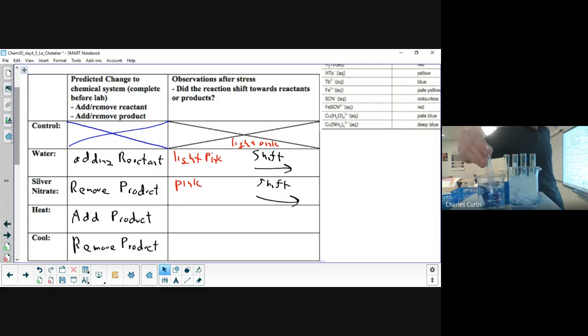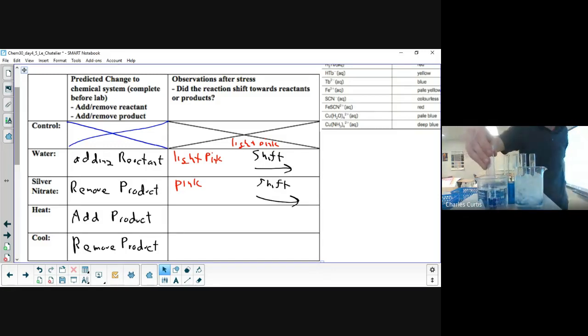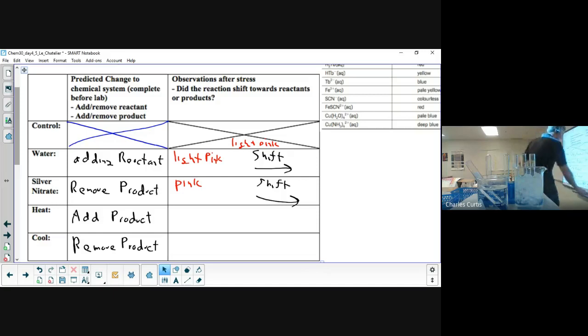Now, it takes a little bit of time for that heat to transfer. But right away, I'm starting to see something. The top is turning blue. Let's see if that's what happens to the whole solution. Hopefully you can see that blue color forming. Yeah, definitely a blue color. It is not pink anymore. So when we added a product, we're adding thermal energy or heat, it shifted towards the blue.